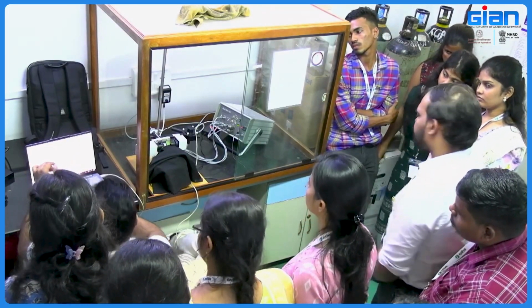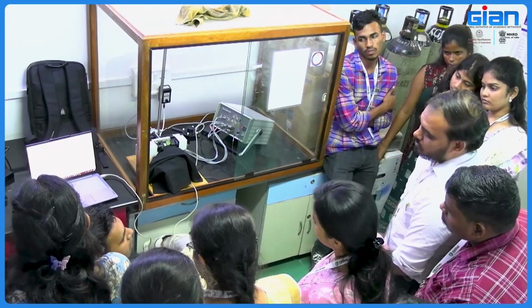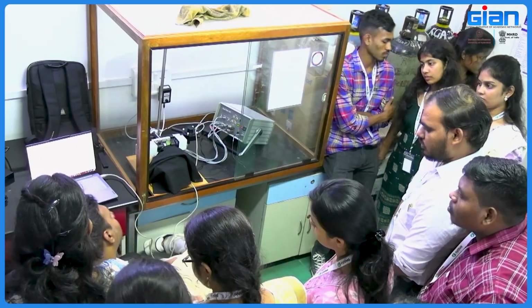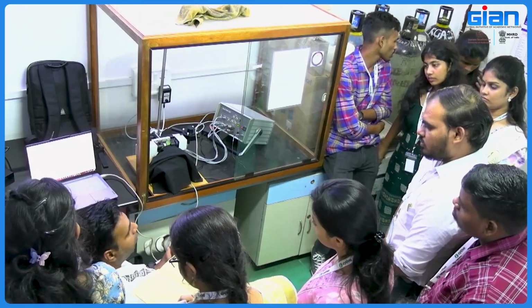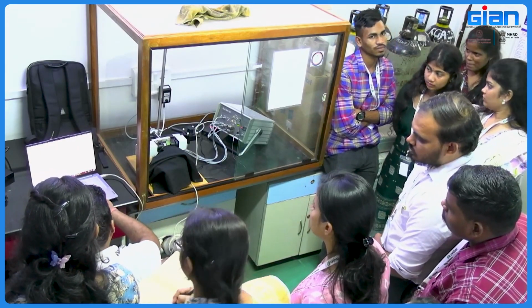So these three things you already know. Then comes your YNPQ by 4, which is a normalized form of NPQ. NPQ has many components. I am not going into details of everything. It's a kind of normalized form. Usually we don't plot NPQ by 4, so we'll avoid that. Then ETR2, ETR1.